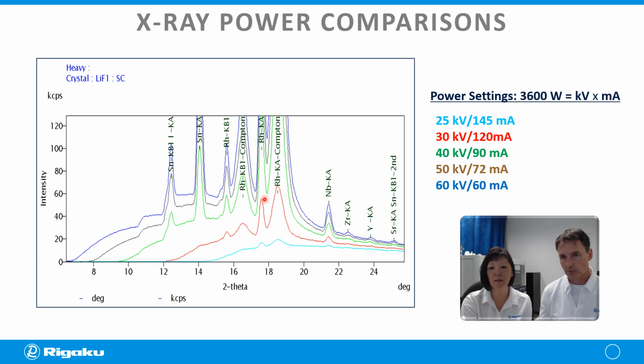And we'll show all this during our next session when we are actually on the instrument building the methods, where you change the power and you'll see the differences in this. It's just going to be a little background, so when we go in and we do those things, it gives us some perspective.